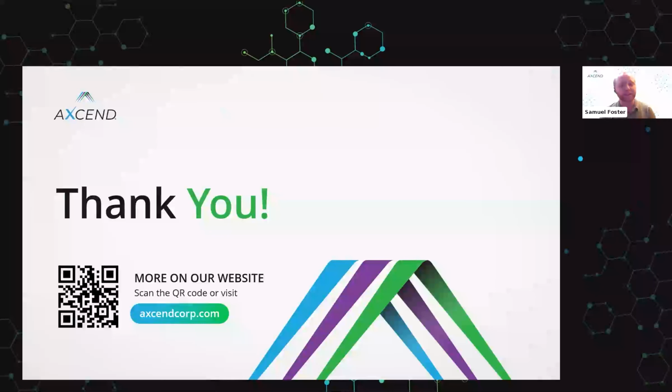So they are slightly different. It is a 25 micron ID tubing with a 50 micron ID bore size. And so there is a slight difference there that will cause some band broadening. That being said, the actual volume of the union and the amount of broadening caused by that is fairly low. We are looking to improve that. They don't make 25 micron ID or 25 micron bore size unions. We are looking to eliminate that union completely, as any union there will cause extra column band broadening. And so it is something that is an ongoing development project, and there are a lot of really cool ideas we have to limit that. So stay tuned, because it is something where we can get even better.